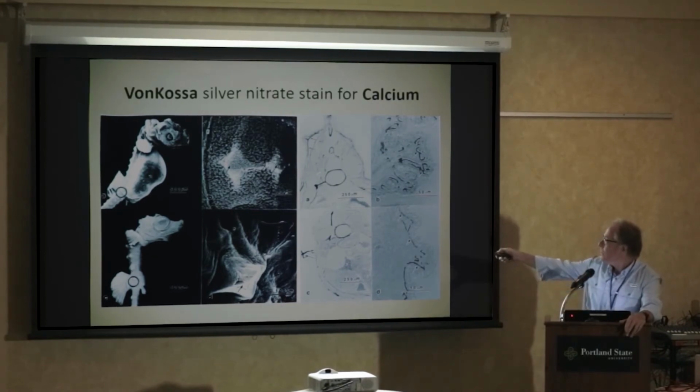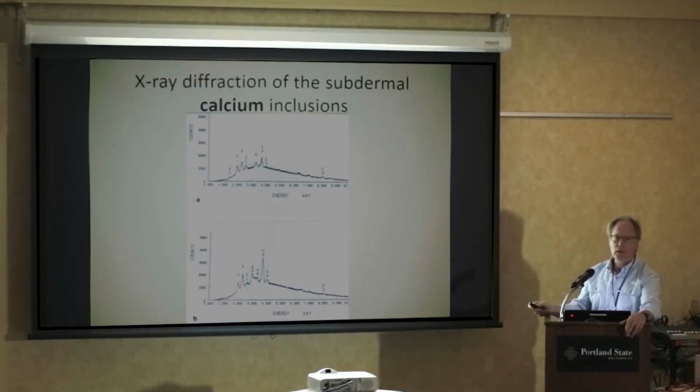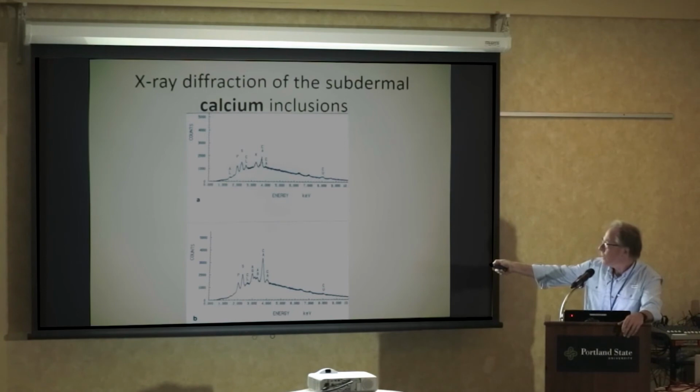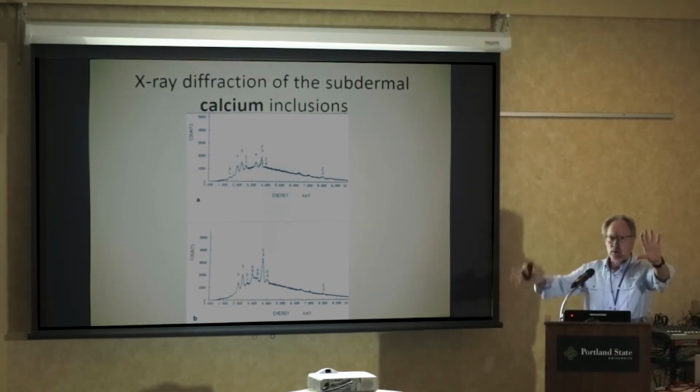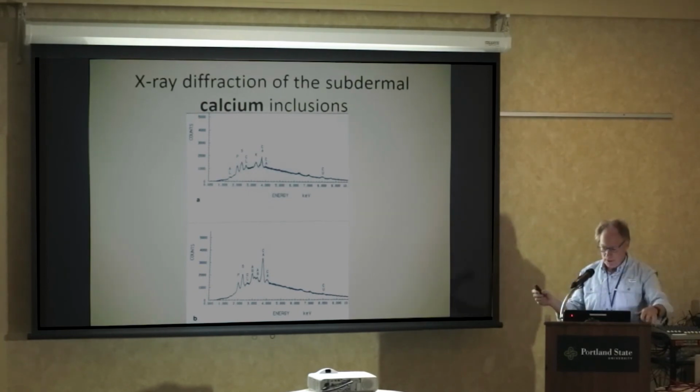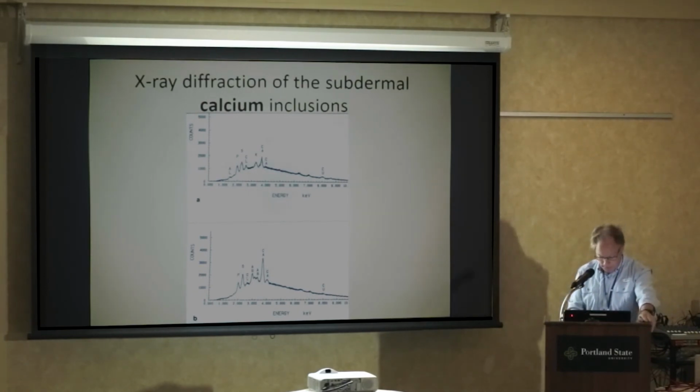So I've got calcium showing up here and here, here, and then I'm assuming this is the same structure. We can then take the same thing and put it under the X-ray diffraction analysis beam under the TEM, and you get a calcium spike. Lower here at the beginnings of the calcification, right around 3.79, and peaked here right at parturition. So again, just more visual data combining light microscopy, TEM, and in this case, X-ray diffraction analysis.